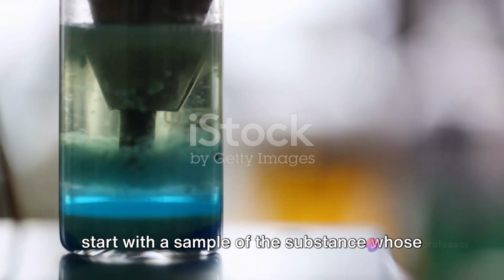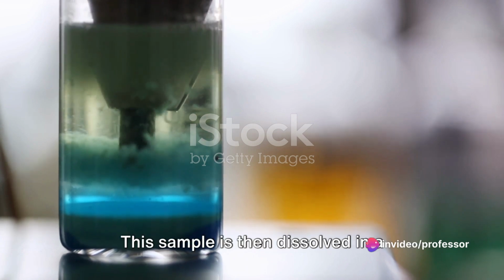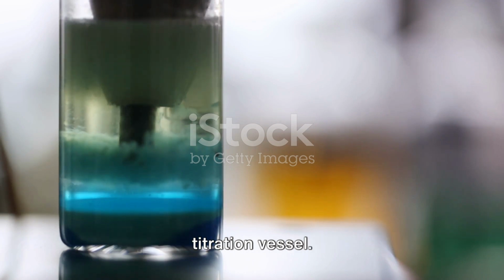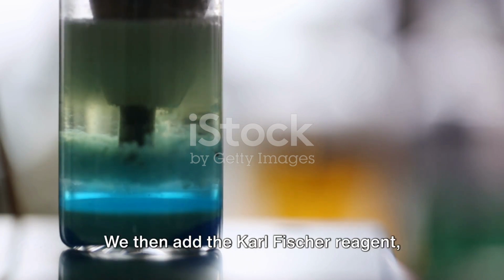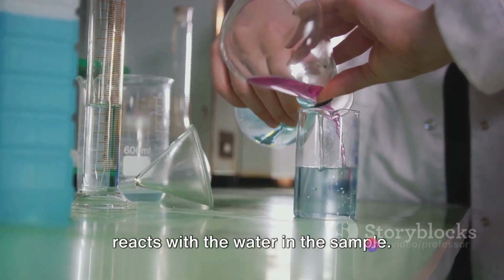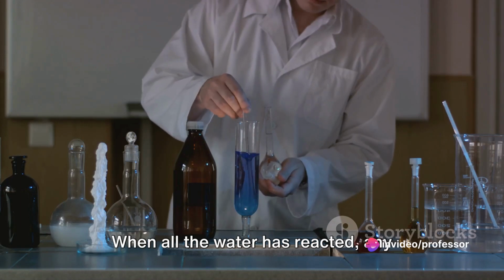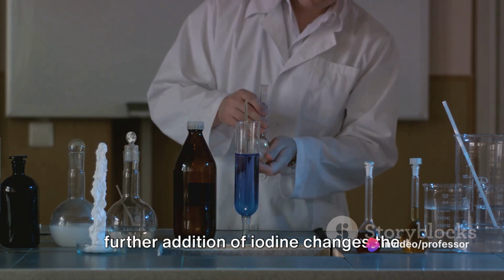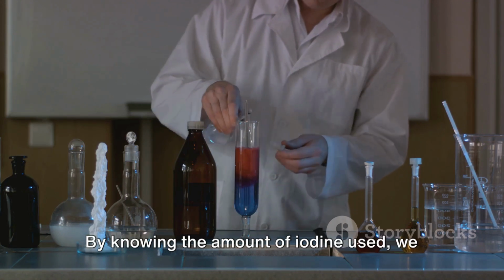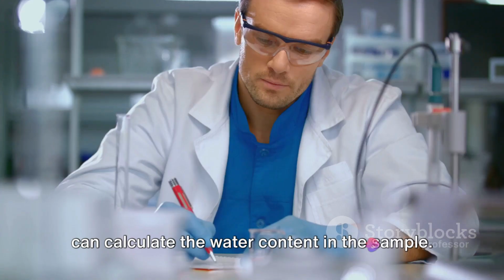We start with a sample of the substance whose water content we want to determine. This sample is then dissolved in a suitable solvent, such as methanol, in the titration vessel. We then add the Karl Fischer reagent, which contains iodine. As the titration proceeds, the iodine reacts with the water in the sample. When all the water has reacted, any further addition of iodine changes the color of the solution, indicating the end of the titration. By knowing the amount of iodine used, we can calculate the water content in the sample.